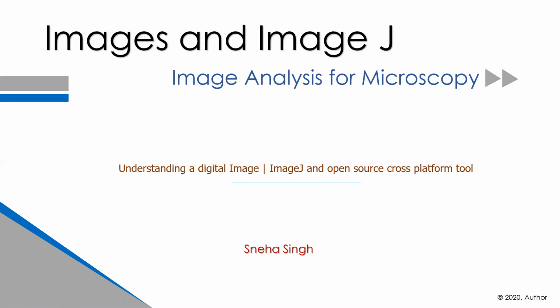Hello everyone, I welcome you all to the practical session of day 2. So today we will learn about the image analysis of microscopy using ImageJ.